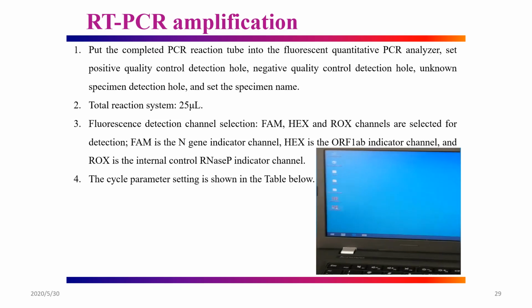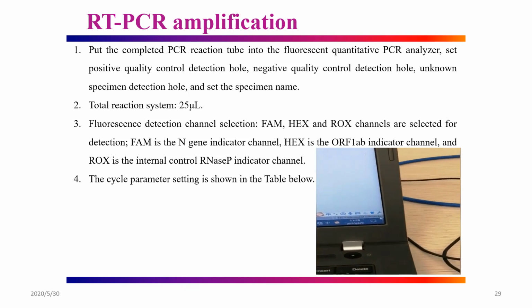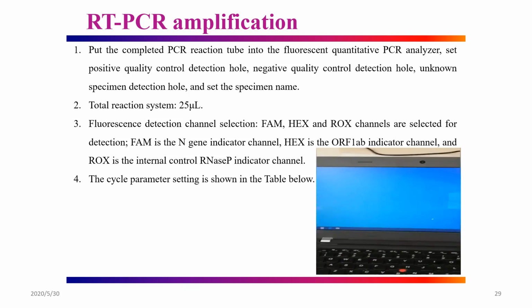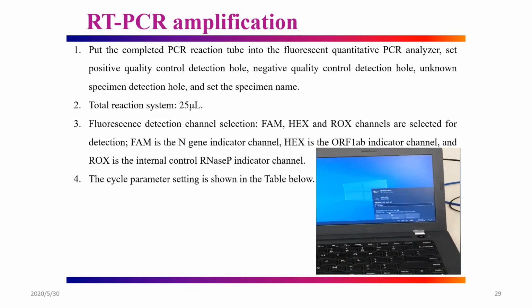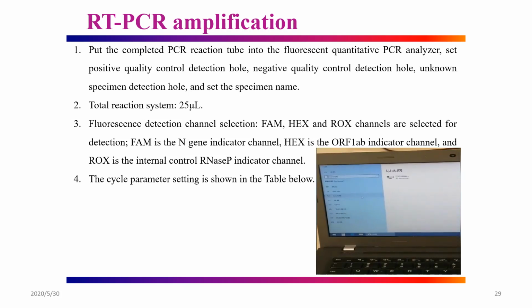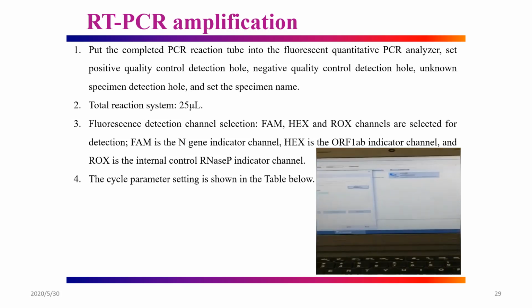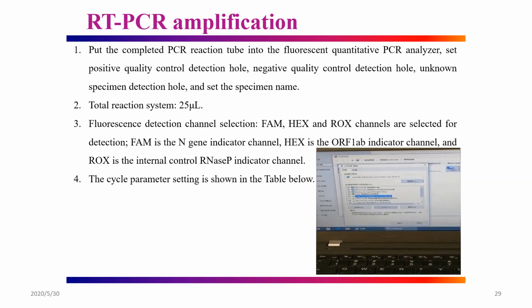Double-click this icon and you can see whether the instrument is connected or not. If not, we need to set the IP address. You could click here to find the setting. You should select version 4 to set.